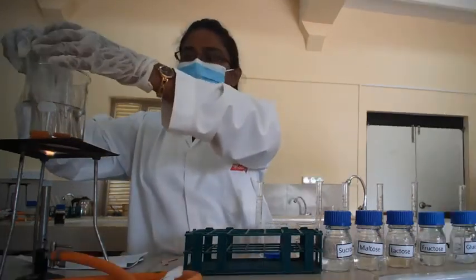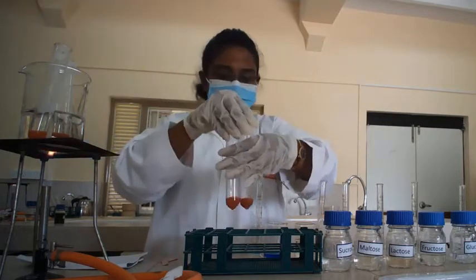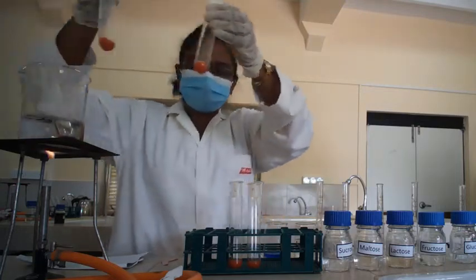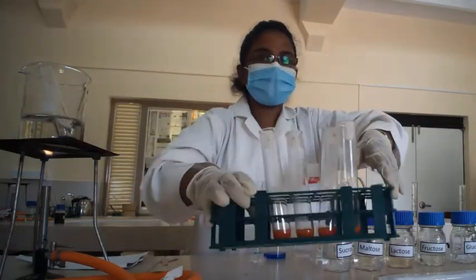You can see all the reducing sugars turn into the brick red color.